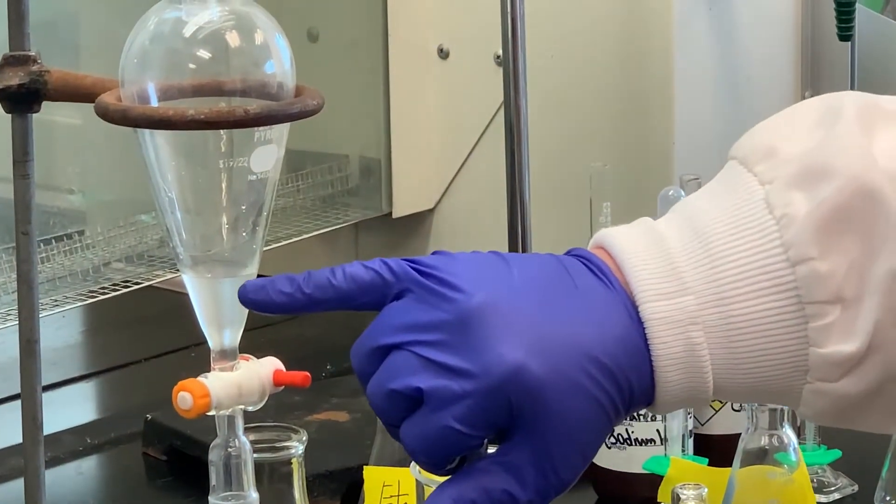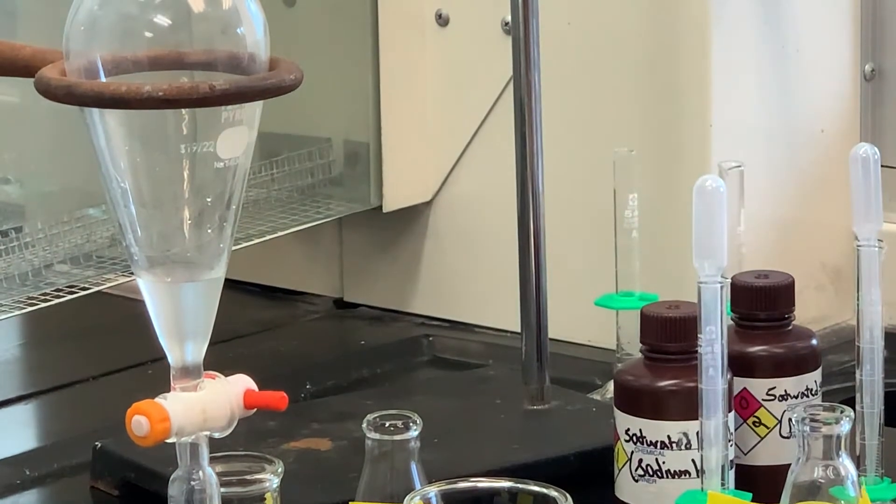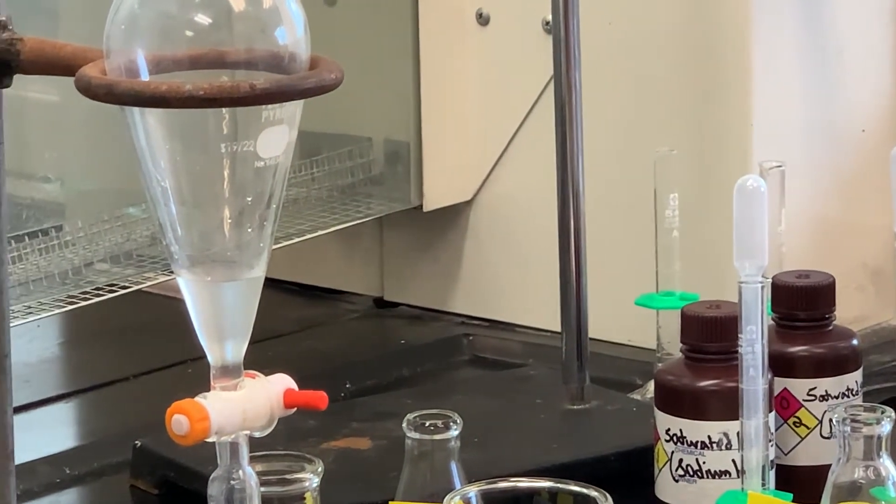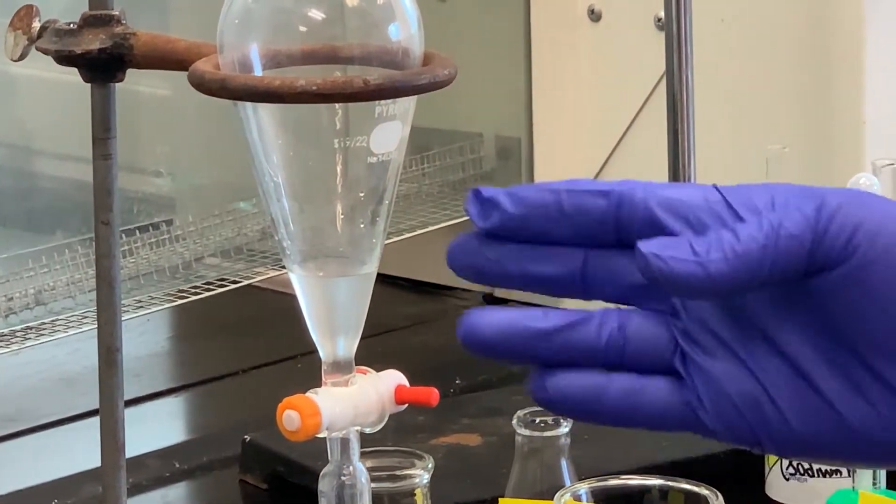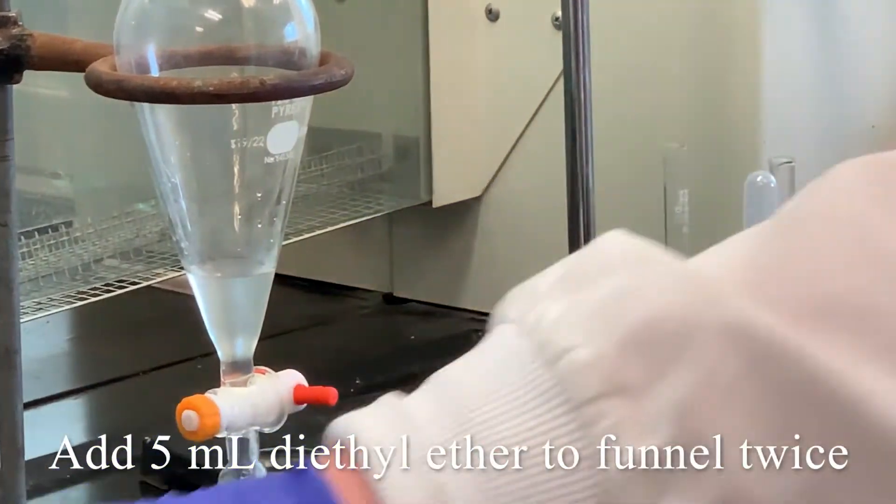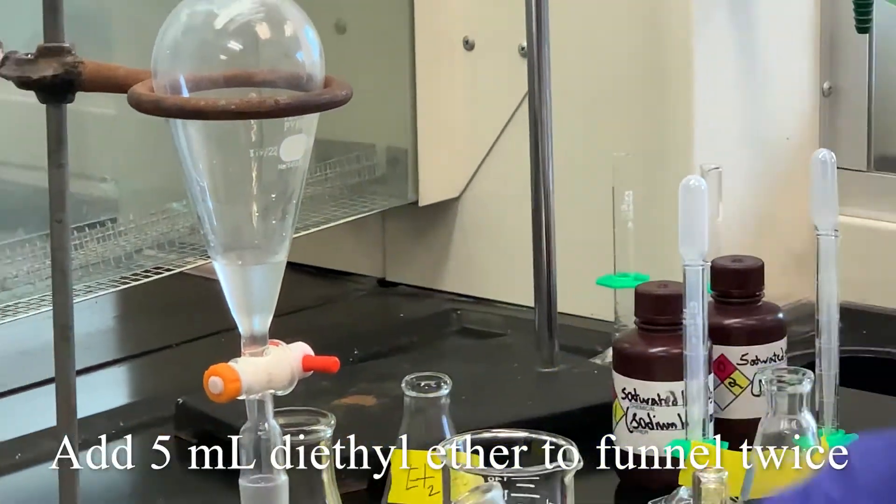It almost looks like a meniscus layer. That is the organic layer that we have. So what we're going to do, I'm going to add five milliliters of ether, diethyl ether, to this.